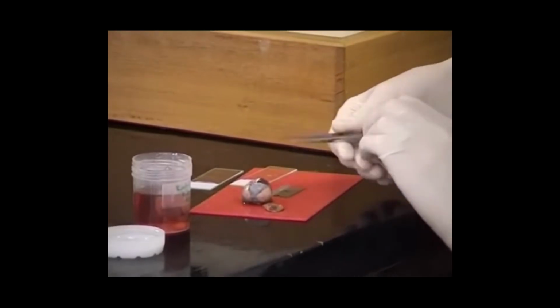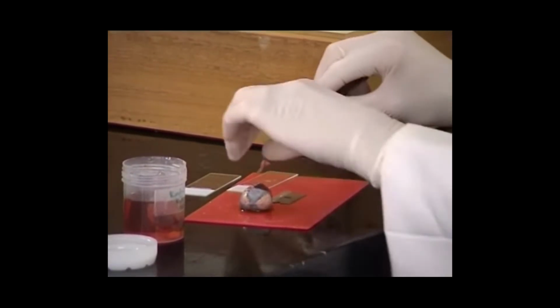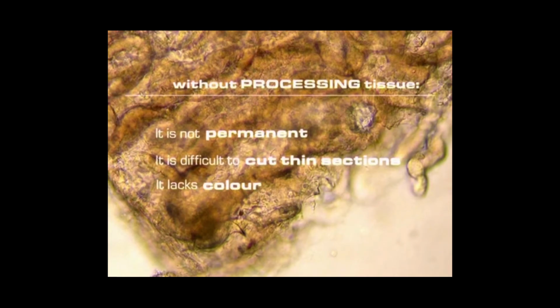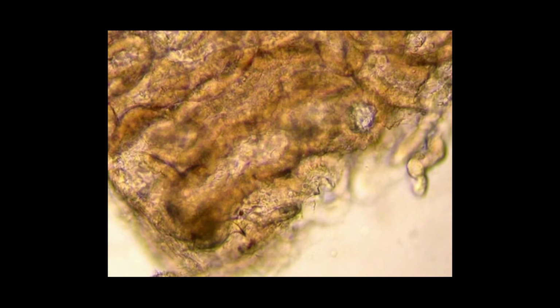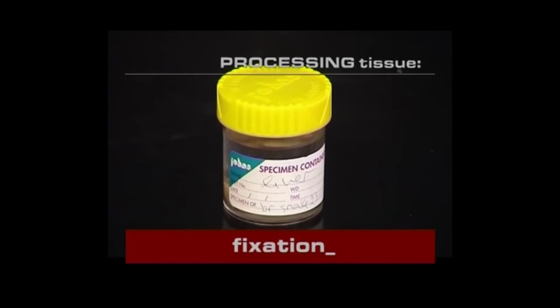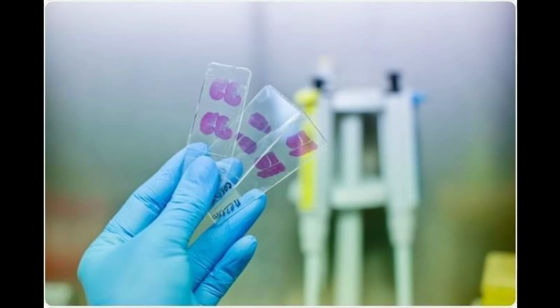Fresh tissues are usually examined when there is an immediate need for evaluation. A better and more effective means, however, of studying tissues, whether normal or abnormal, is by examination of their sections and smears which have been permanently preserved, stained for demonstration of specific structures, and mounted on glass slides with cover slips for permanent keeping. The one that you can see in your human anatomy and histology laboratories. Can you remember that? Those slides are created in the histopath lab.